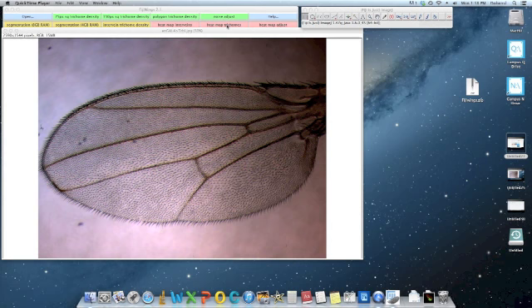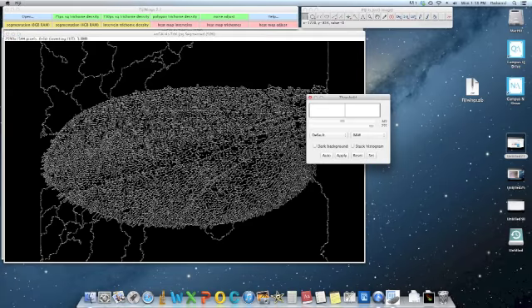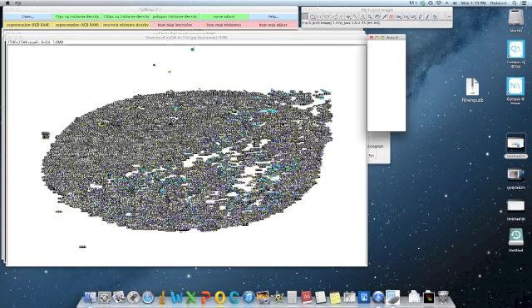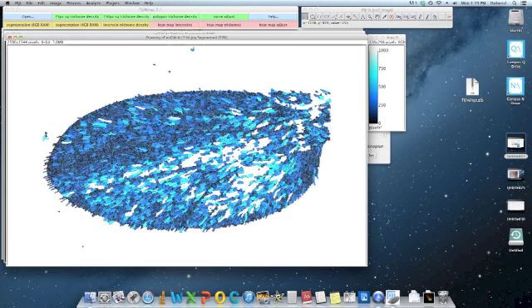When it's applied to an Engrailed-Gal4 driving tribbles wing, you can see the progress going along this bar at the top. It finds the trichomes, identifies an area for each, and then applies a color. Here you can see the trichomes are much more widely distributed, so the color heat map is hot and the color is cooler where the normal distribution of trichomes occurs at the top.